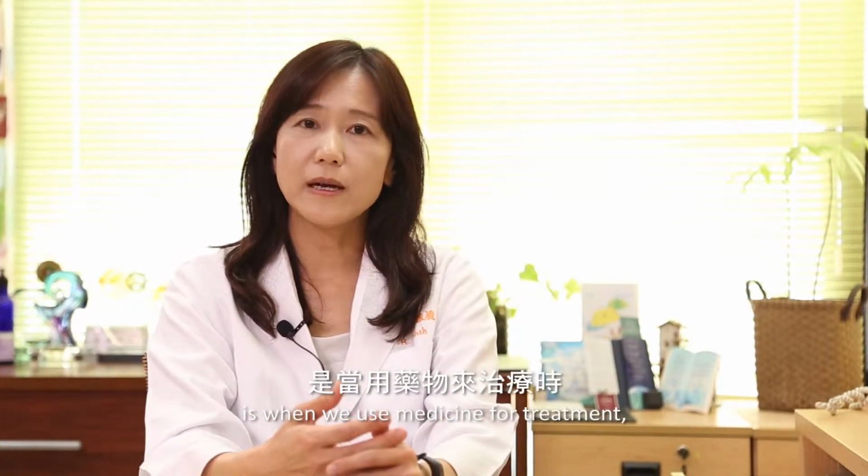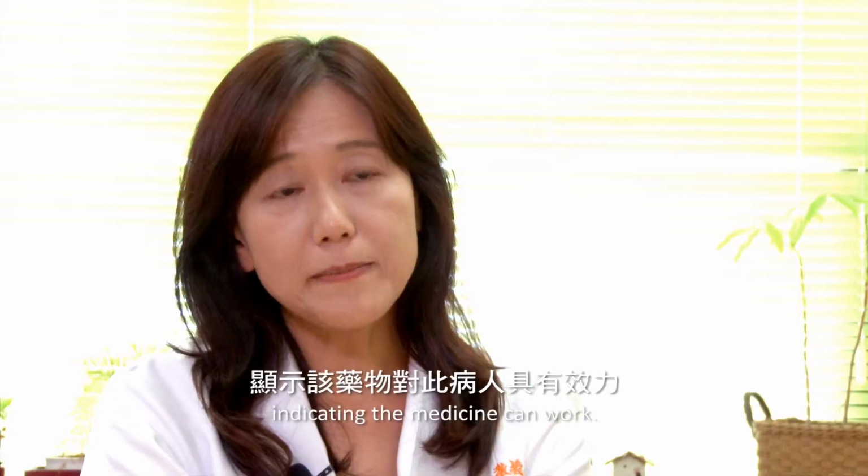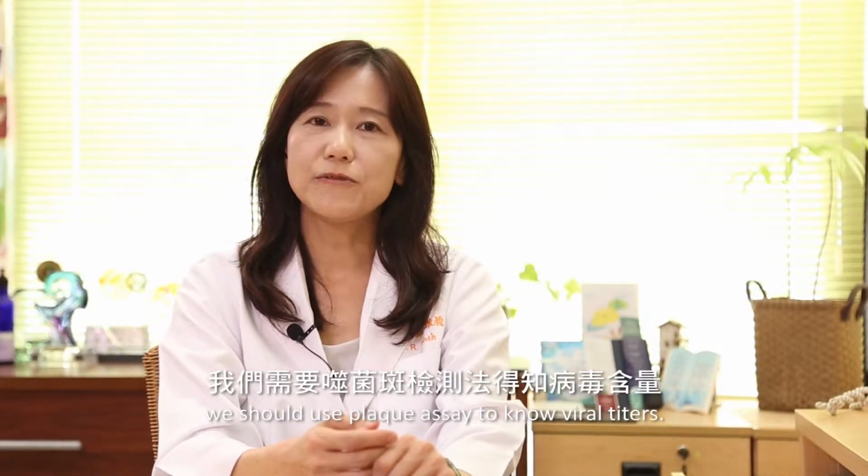Another thing is when we use medicine for treatment, we would like to know whether the patient's viral titer decreases. If the virus decreases, it indicates the medicine can work. This is why we should use Plaque assay to know viral titers.